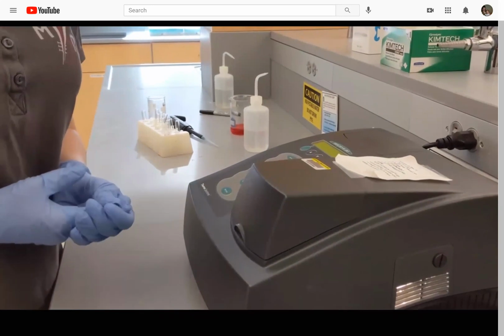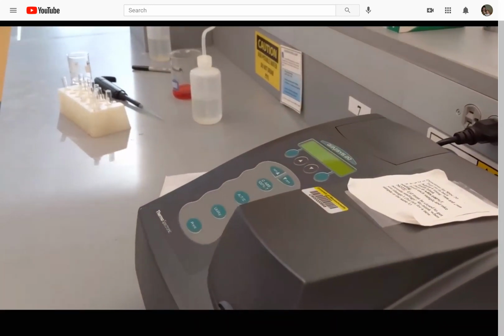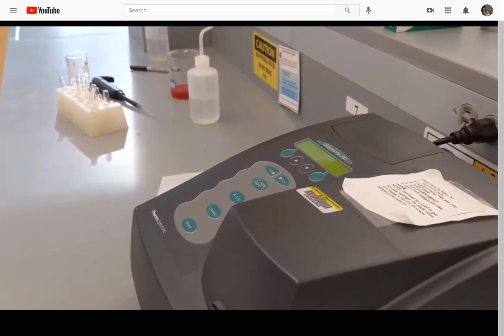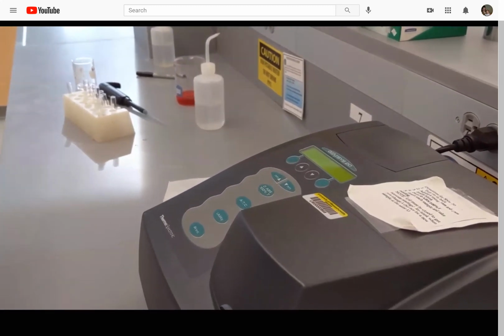And that absorbance value is 0.233, so I'm going to write that down. And that is it for the experimental section. We'll then go into some of how to process the data.